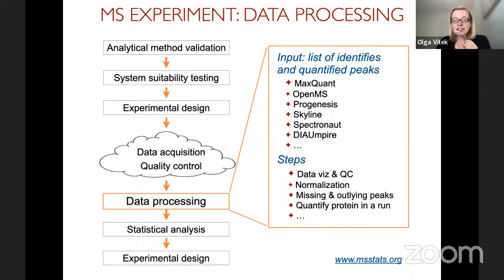Well, so once the experiment is designed and data are collected, then a really important part is data processing. As I mentioned, we are equal opportunity. We're trying to be as inclusive as possible with various types of data processing tools. The converters pay attention to this type of quality control. However, a lot of these decisions are somewhat heuristic and somewhat subjective.